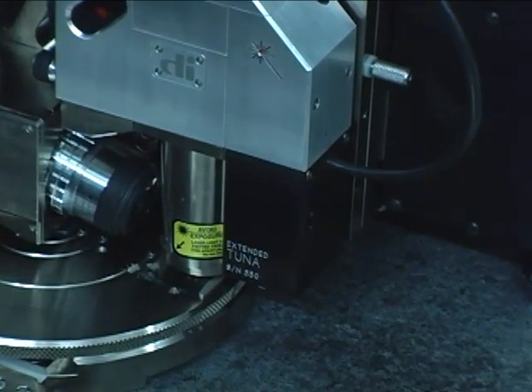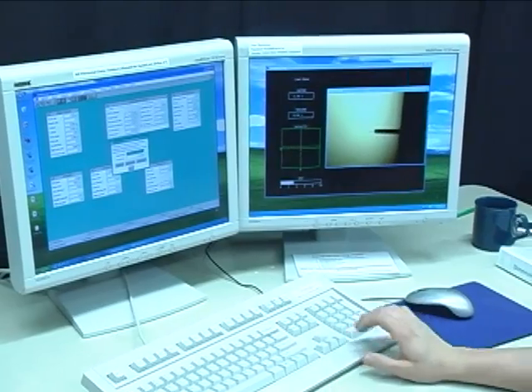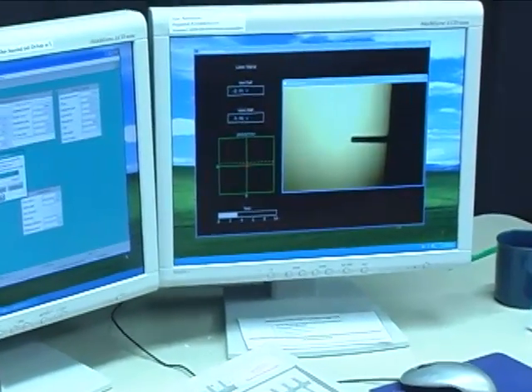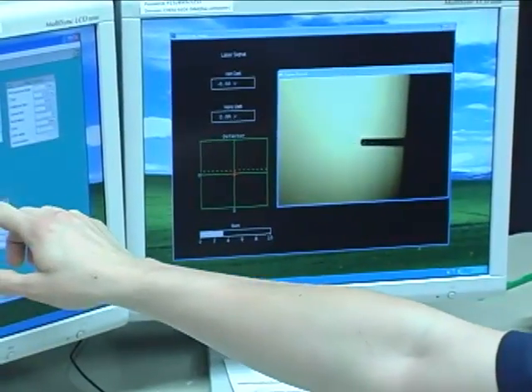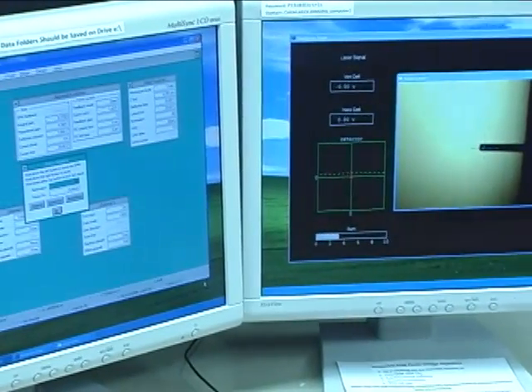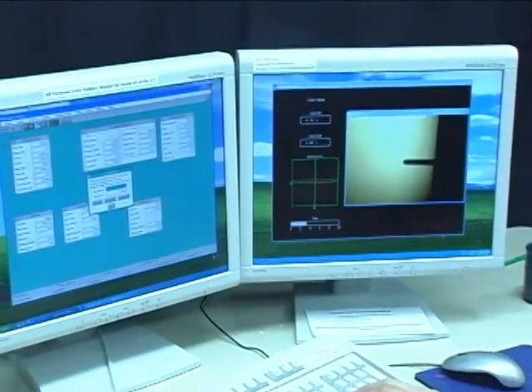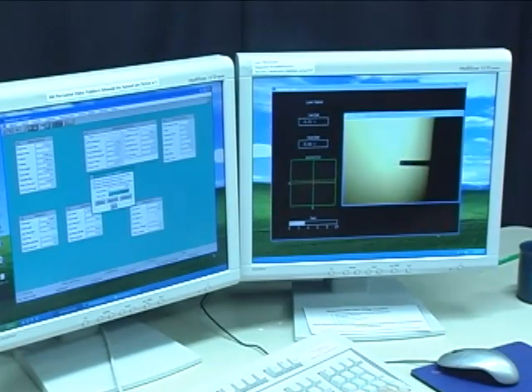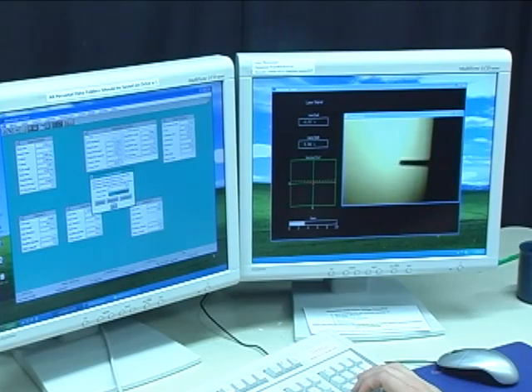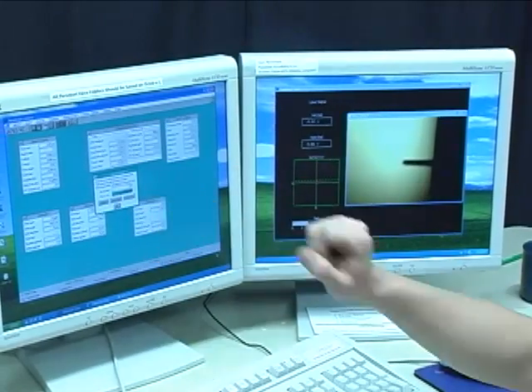And then I will look at the optical image on my screen. So we have two options when actually focusing on our surface. We can choose to focus on the surface itself if we expect it to be dusty or not reflective. However, if you have a clean, transparent surface like we're working with now, it's easier to focus on the reflection of the tip on that surface. So we'll select focus on tip reflection.